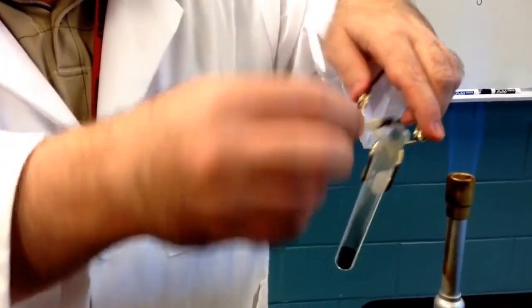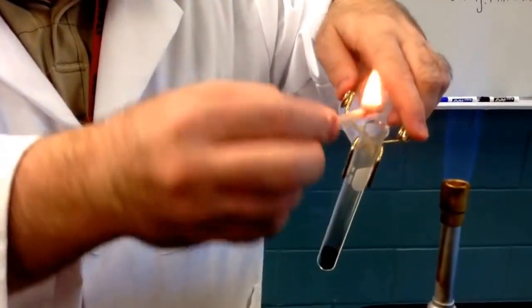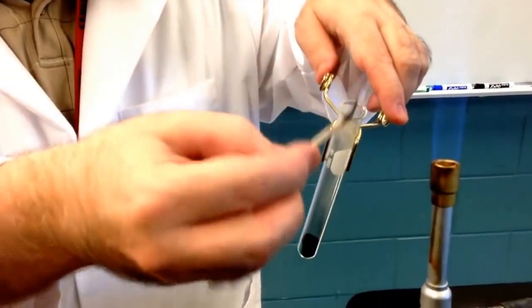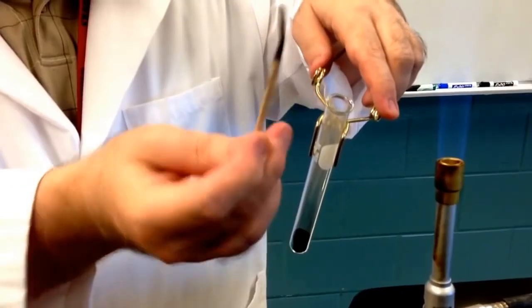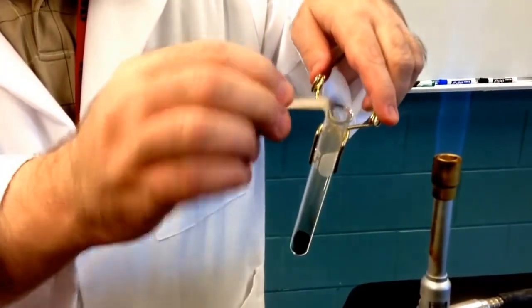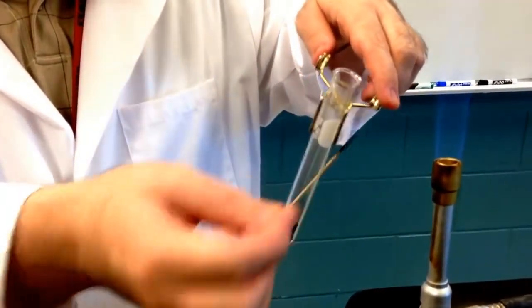And indeed, it does go out. And I'm not sure if you noticed, but the flame actually turned a little green, and that's because some copper actually got on the wooden splint, and the copper will burn green. So if that happens, that's normal.